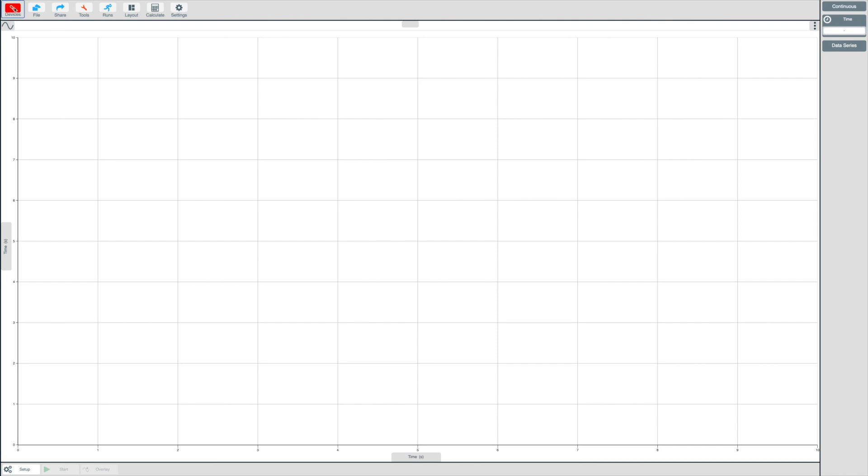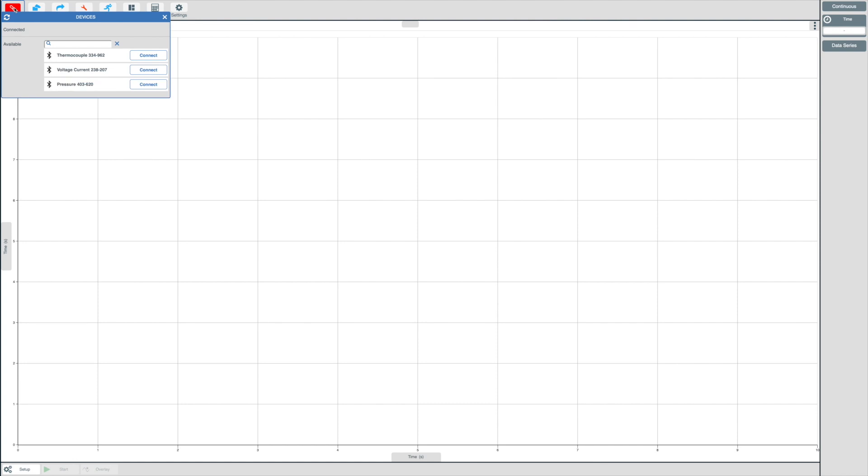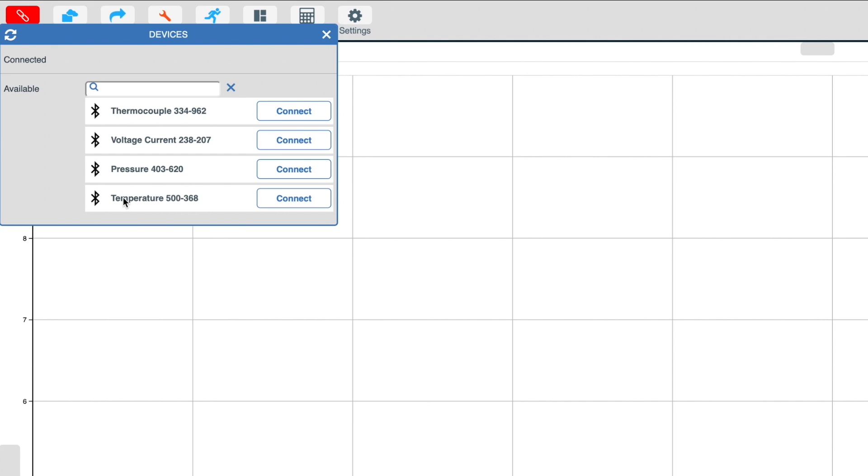When you click this button, it will show all of the available devices in your local environment. In this instance, I have four devices available: a voltage current sensor, thermocouple, temperature and pressure.